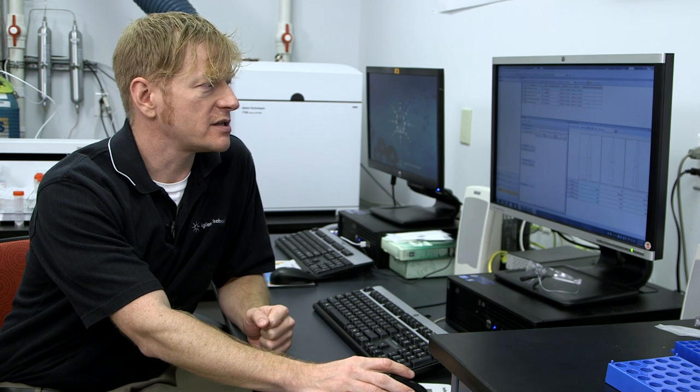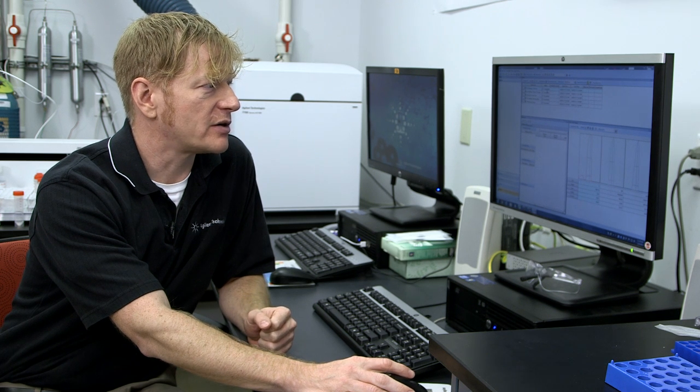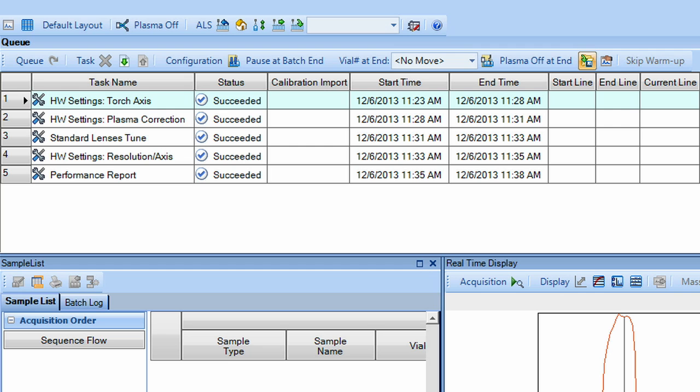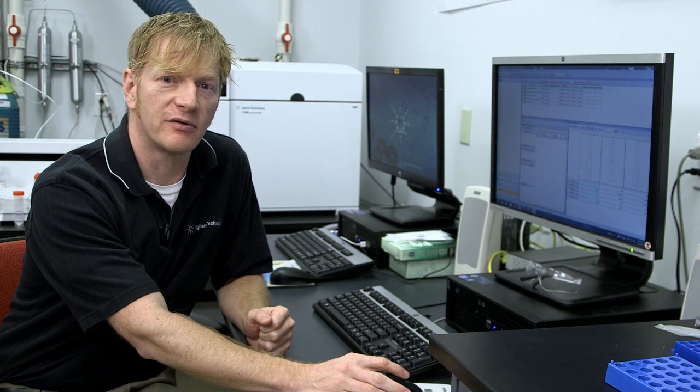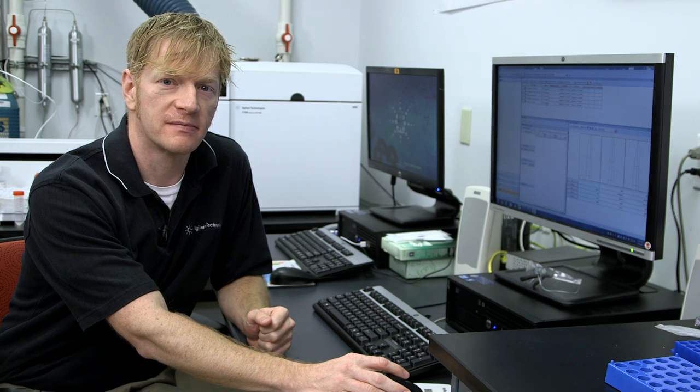So as you can see, the startup protocol has succeeded for all the parameters that we had selected. Now we can develop our method and run our samples. And this is done through the batch.